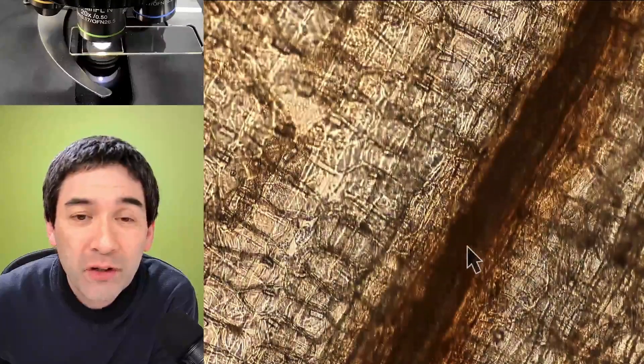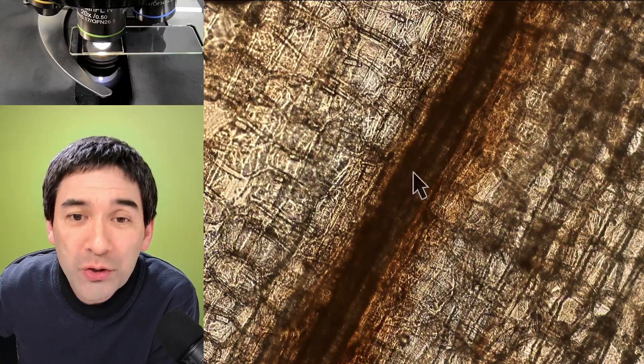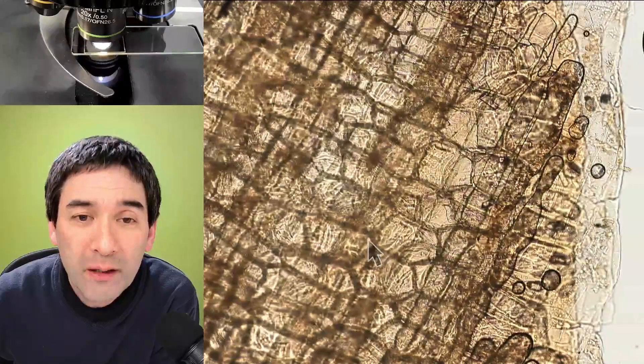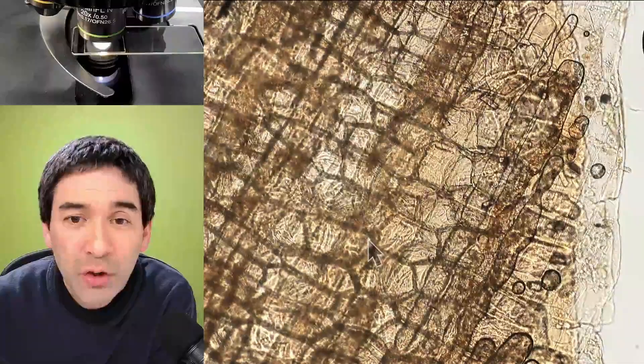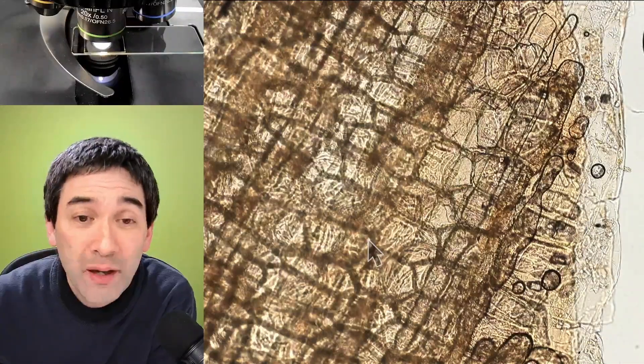You can also see over here those dark lines that you see, these are most likely the vessels that transport water inside the onion. But you can see that the oil as a matter of fact causes this onion skin, the onion tunic, to become quite transparent.